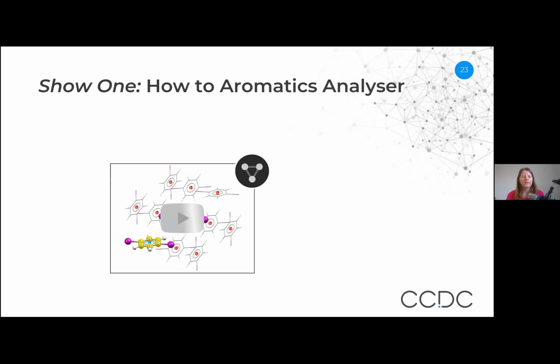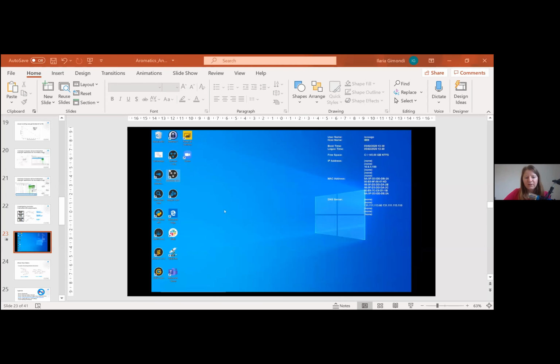Now my colleague Ilaria is gonna show us the how-to video, which you can also find on our YouTube channel. And she will play this for us, and then we will have a live demo in Mercury on how to use the tool. Now Ilaria is trying to share the screen.